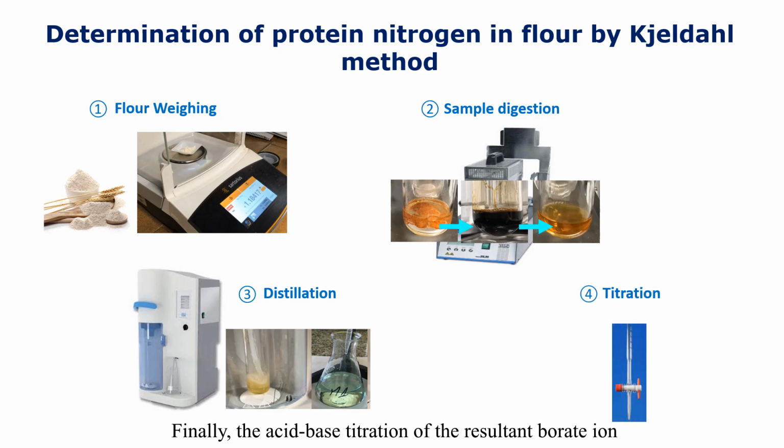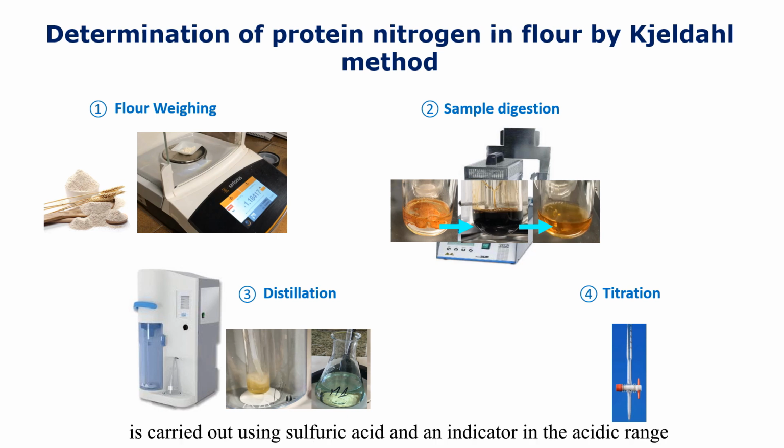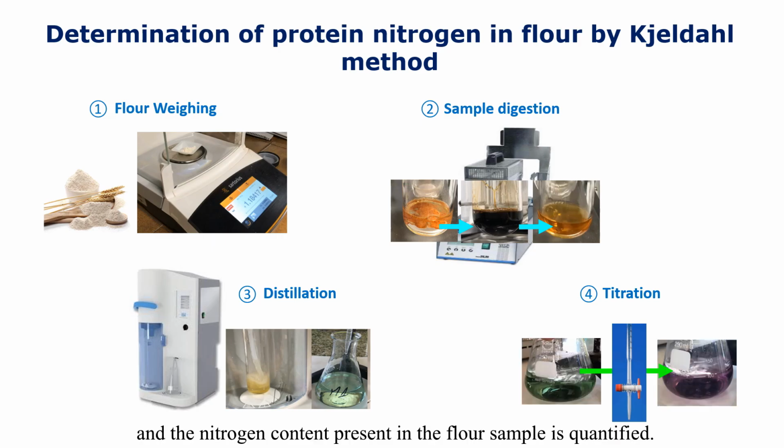Finally, the acid-base titration of the resultant borate ion is carried out using sulfuric acid and an indicator in the acidic range, and the nitrogen content present in the flour sample is quantified.